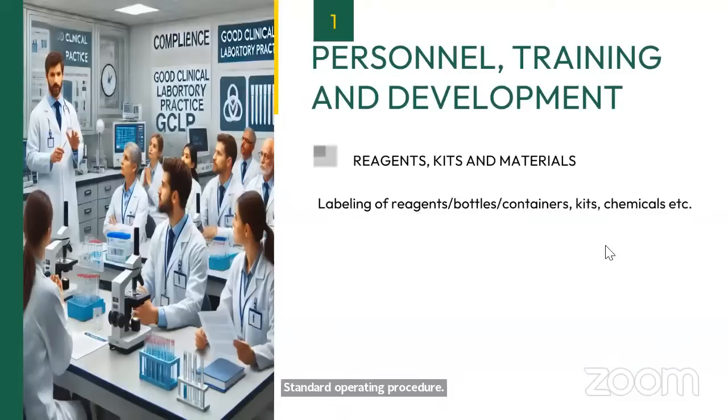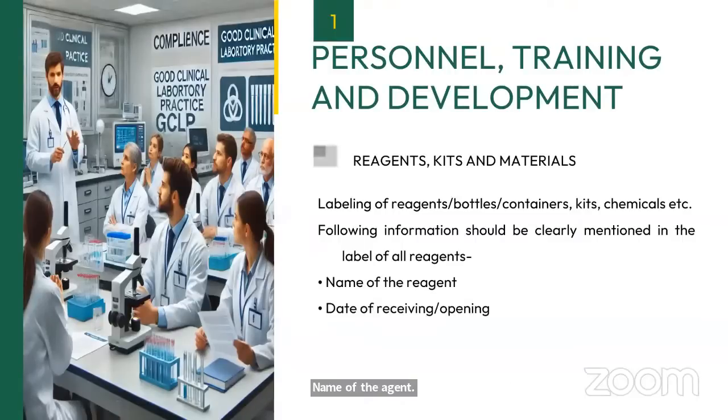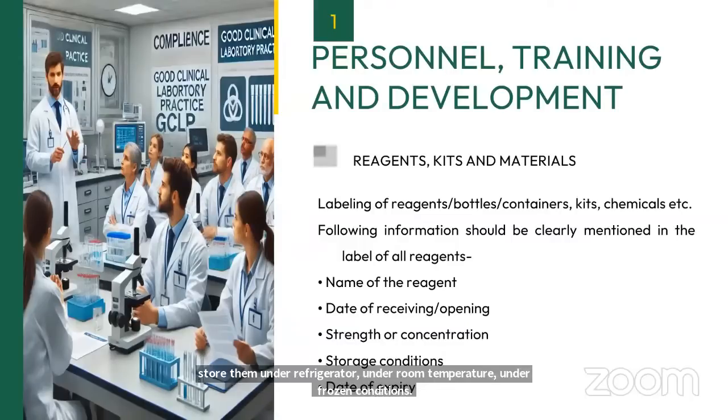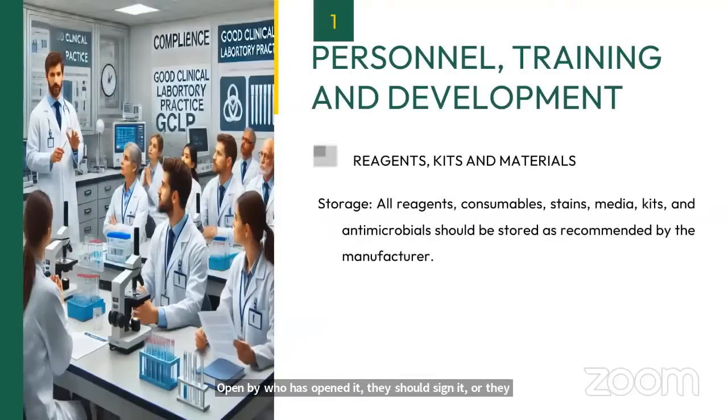Labeling of the reagents, bottle containers and chemicals should clearly include the following information. What information should be available in all the reagent labels? Name of the reagent, date of receiving or date of opening of the reagent, strength or concentration. If you are using any chemicals, they will have certain concentrations, percentage, molarity, normality, all this should be included. Storage conditions, how you are going to store them, under refrigeration, at room temperature, or under frozen conditions, and date of expiry of those reagents and materials. Opened by, who has opened it, they should sign it or at least put some identity.